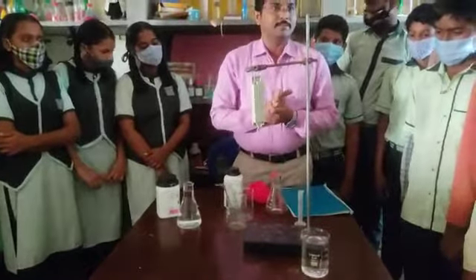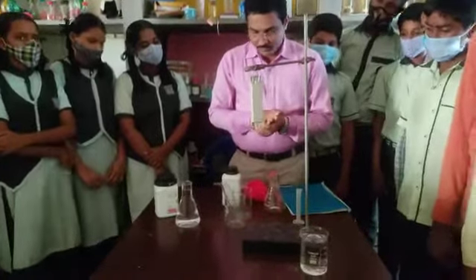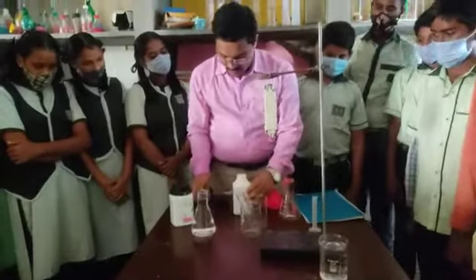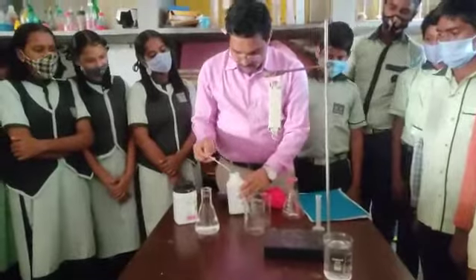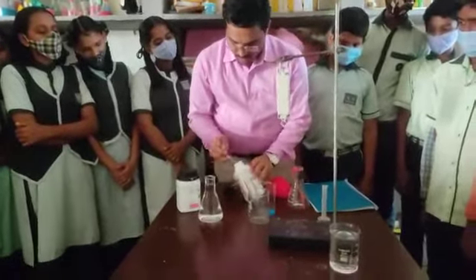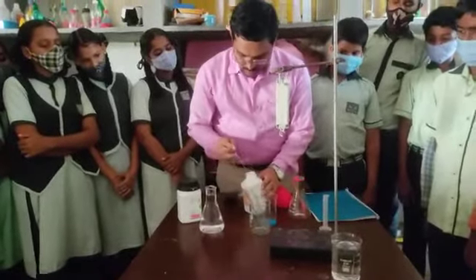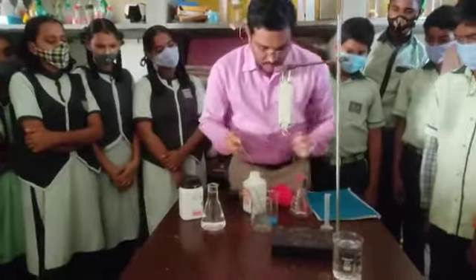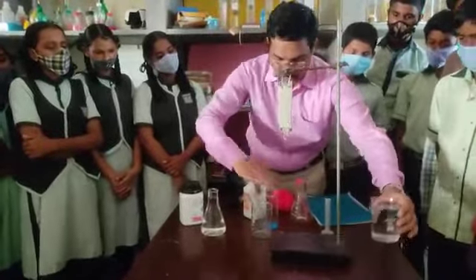First, what you want to do is prepare the copper sulphate solution. Take out the copper sulphate and take it in the beaker. Prepare the copper sulphate solution, then add water to the beaker.